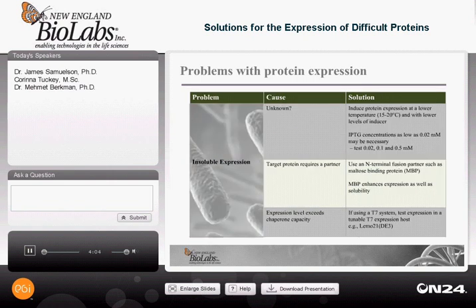The next problem that I will address is insolubility of the target protein. Folding of heterologous proteins within E. coli is far from an exact science. Therefore, the cause of misfolding is often unknown. It is thought that folding problems are primarily due to the inherent nature of each unique protein and the capacity of the chaperone pool to mediate its proper folding.